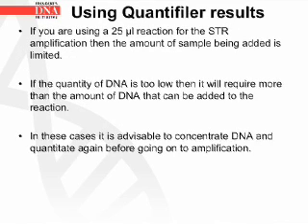If you're using a 25 microliter reaction for the STR amplification, then the amount of sample being added is limited. If the quantity of DNA is too low, then it will require more than the amount of DNA that can be added to the reaction. In these cases, it is advisable to concentrate the DNA and quantitate again before going on to amplification.